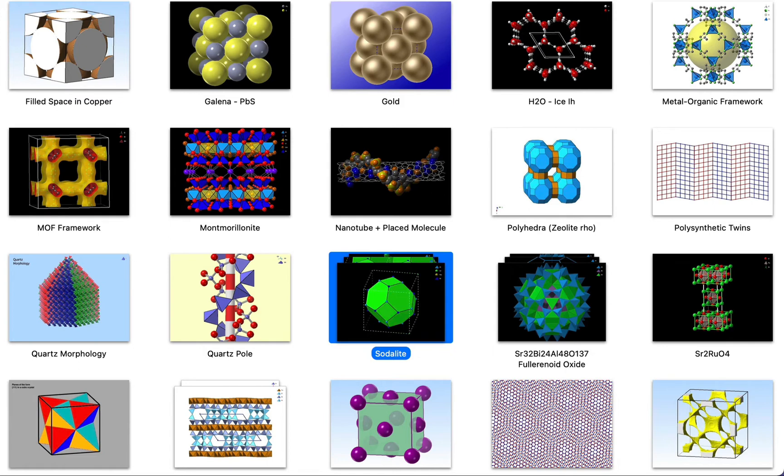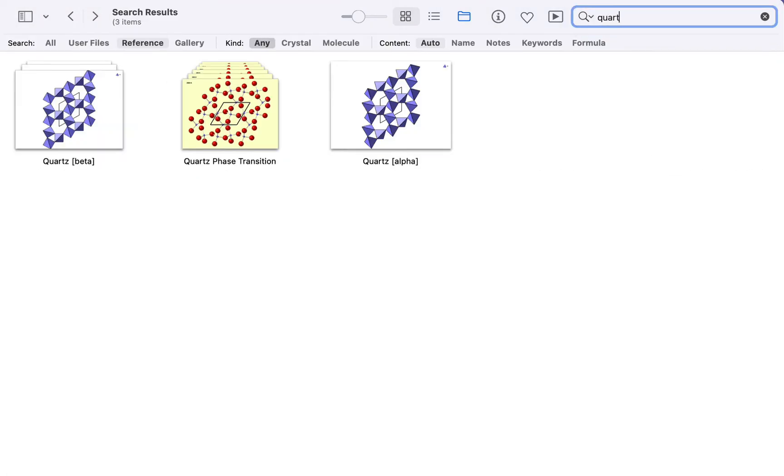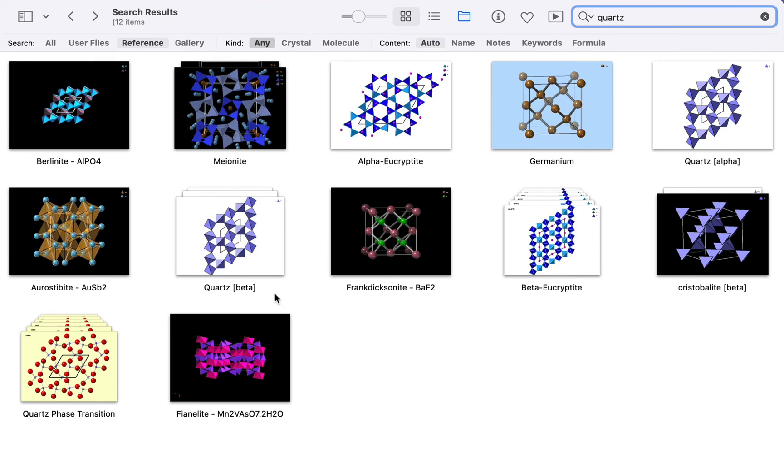Animation is particularly useful when trying to understand how structures change with pressure or temperature. Let's take a look at the structure of quartz as a function of temperature. Here's a multi-structure file showing quartz changing on heating. In fact, this file shows the alpha-beta phase transition in quartz at about 570 degrees C. We can preview it in the browser like this by moving the mouse over the thumbnail, but things really come to life in the viewer.